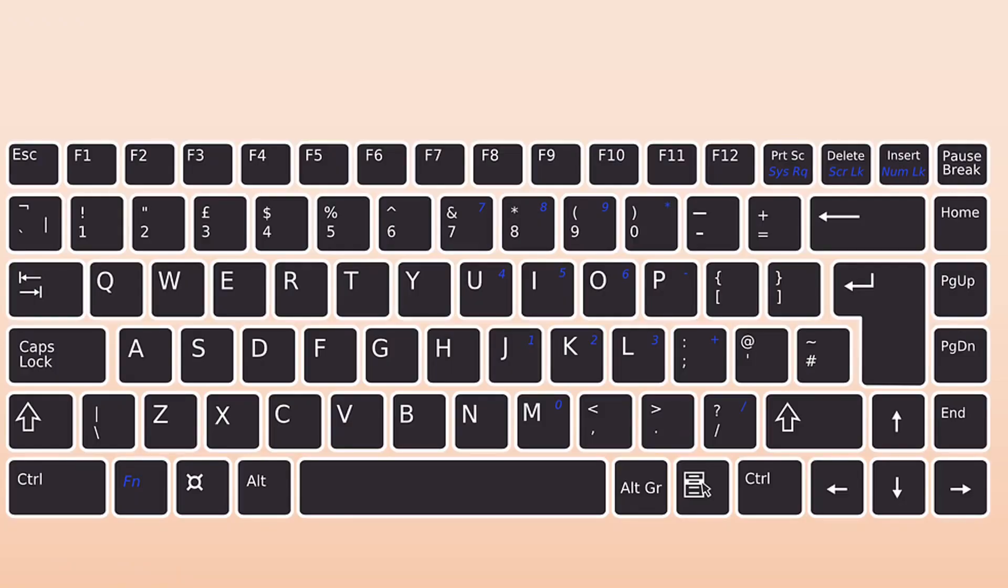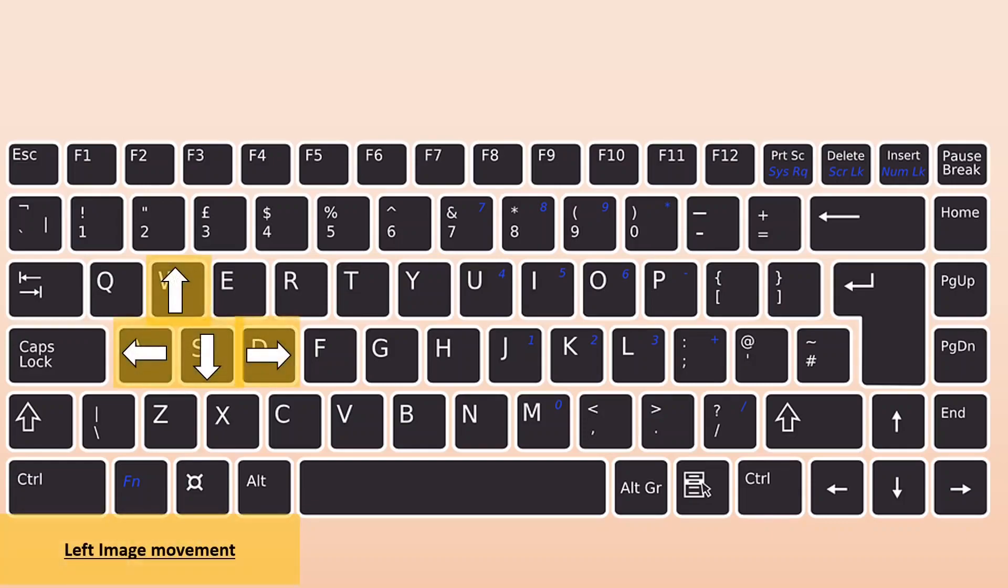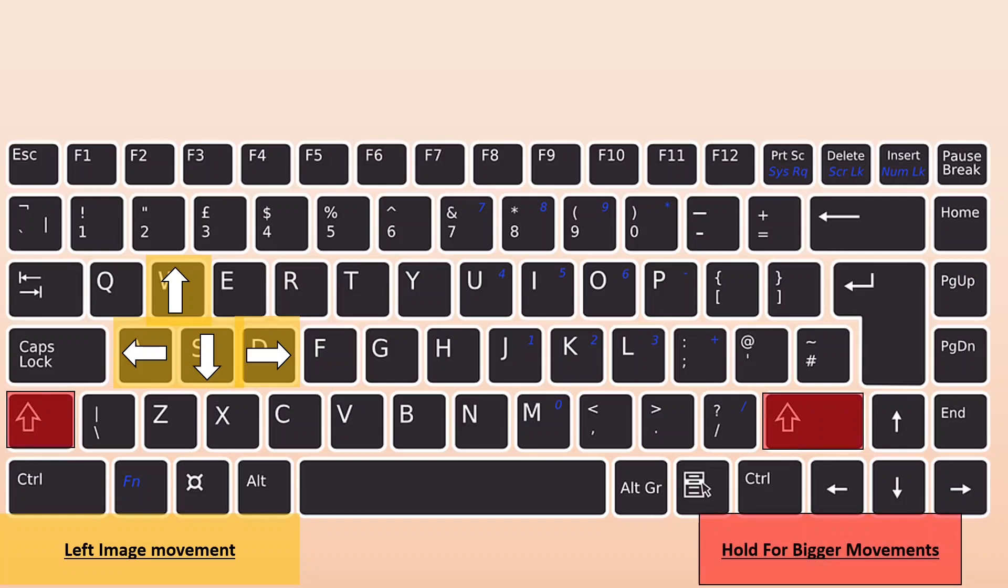You're going to be controlling this virtual comparison microscope using your keyboard. So here's a keyboard. To control them independently, for the left image and you want to move it, you're going to use the WASD keys to move it up, left, down, right, just like that. Those keys control the left image. If you hold down shift, you will make larger movements.